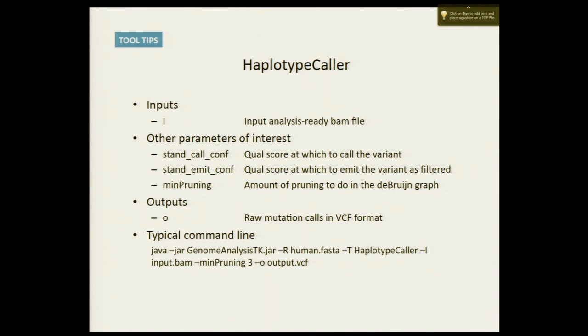What would we do for chimeric molecules? It would not do the right thing. That would show up as a path in the assembly. If there was enough read data to support that path, then it would call that as a variant. Otherwise it wouldn't. So if there are a lot of them, then it would have an issue for sure.